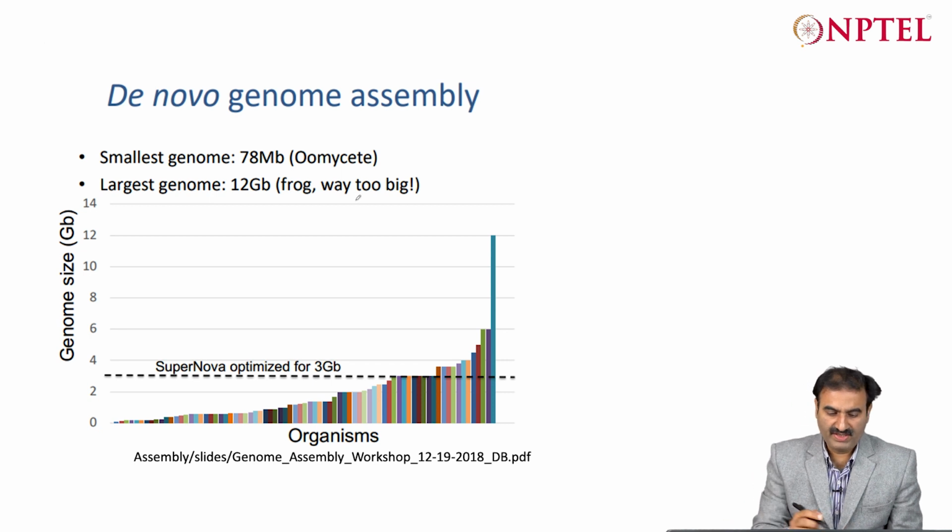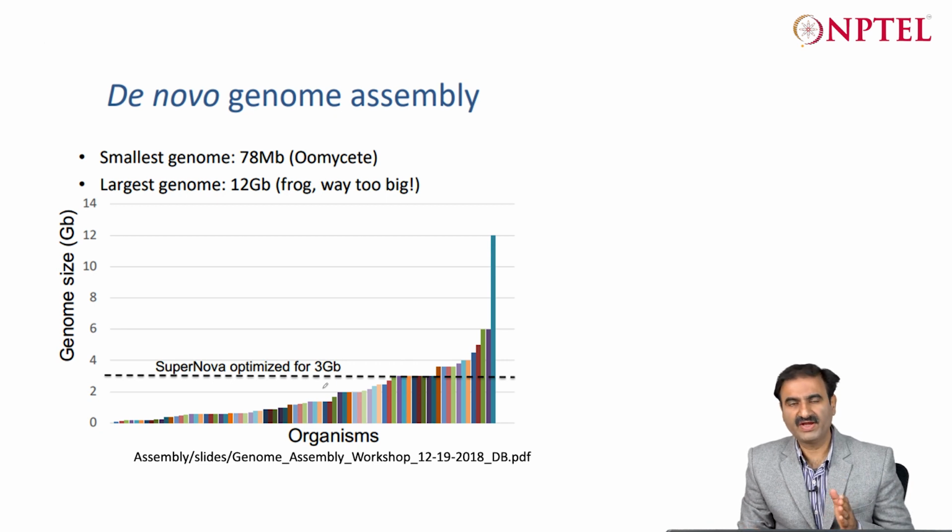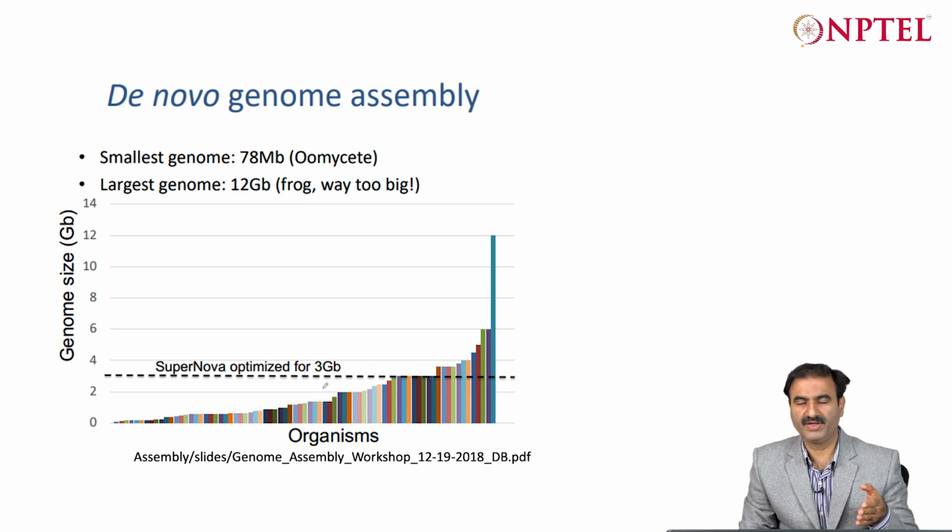and that cannot be assembled by the assembler. So generally Supernova can do best for up to 3 GB of genome, which is the size of human, but till that size you cover almost all the mammals including humans, and a lot of plants, because plants generally range from, for example, banyan tree is just 500 MB, peepal tree is also similar, and turmeric genome is about 1.2 GB. Similarly for amla 1.3 GB. So basically most of the genomes you can cover.